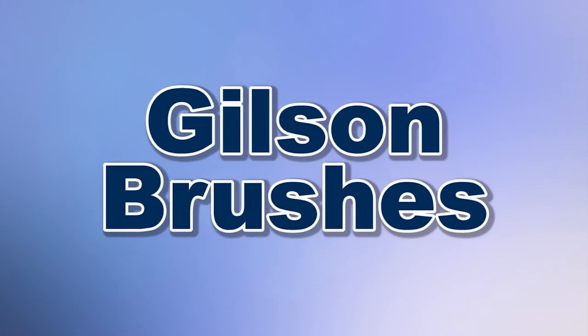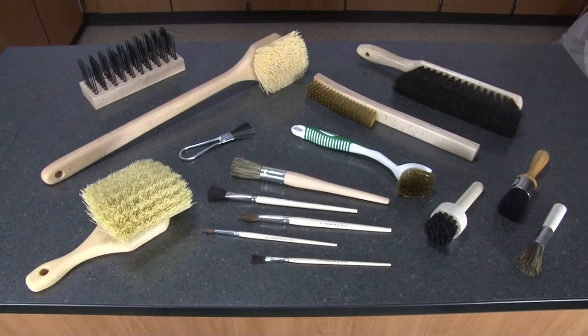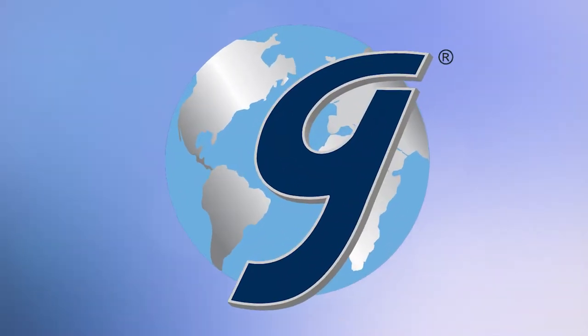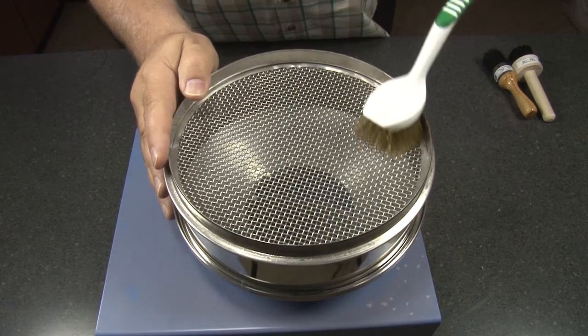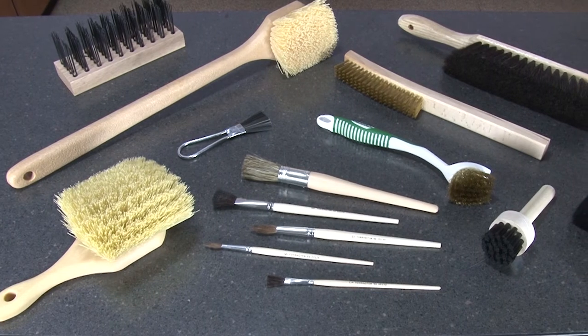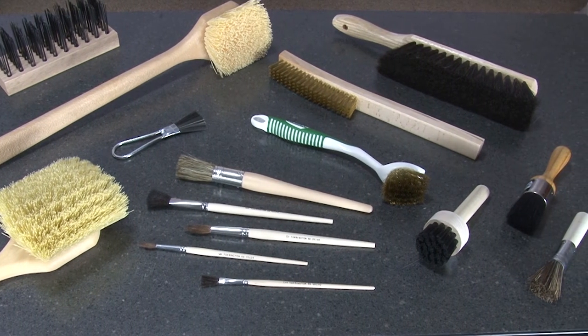When you need to make your sieve maintenance, cleanup, and sample handling more efficient, then Gilson is the right choice. Tackle your toughest cleaning, maintenance, and sample handling jobs with a brush from Gilson. Gilson's wide selection of cleaning and lab brushes in the most useful styles are available for immediate shipping.